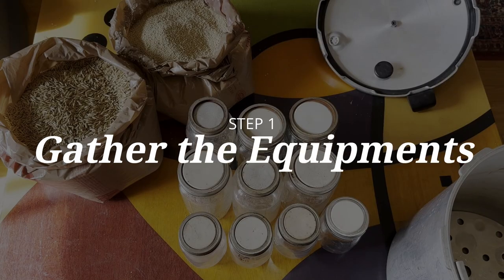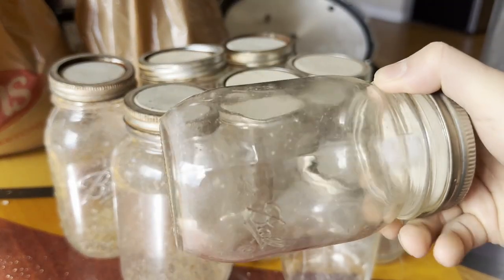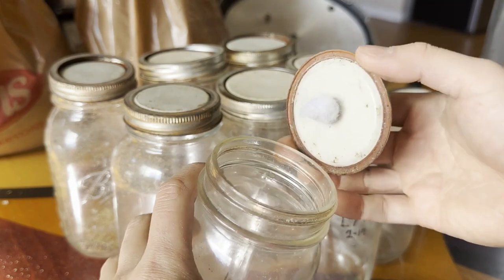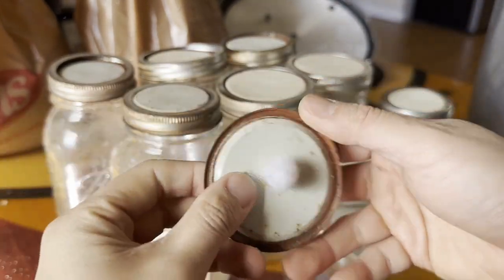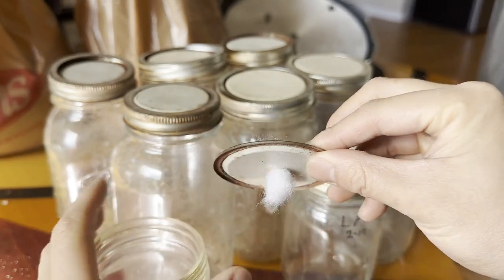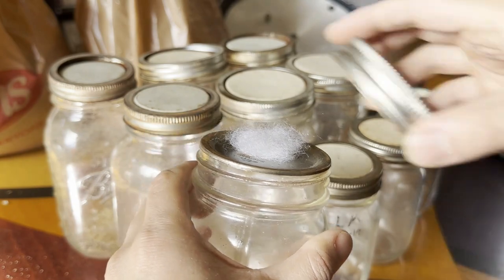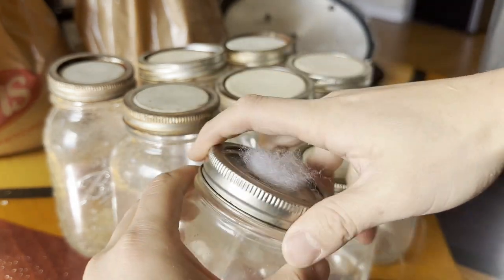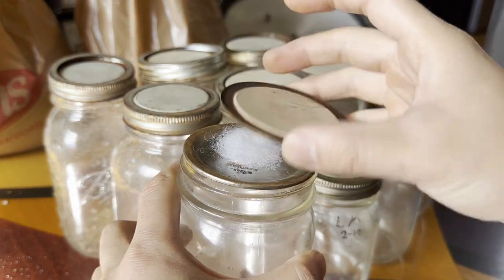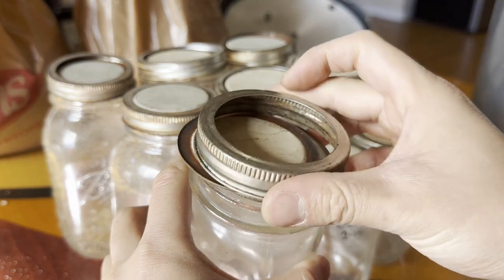In this video, I will show you how to sterilize your grains for growing your own mushrooms at home. These grains are the food source for the mushroom mycelia to grow on. Step one: gather equipment. To sterilize your grain, you need mason jars to hold your grain. Here I have mason jars with a modified lid where I have inserted polyfill or pillow stuffing to serve as a filter to prevent outside contaminants from entering your grains. This will also be where we insert the needle of our spore or liquid culture syringe to inject the spores or mycelium into the grain once it is sterilized.